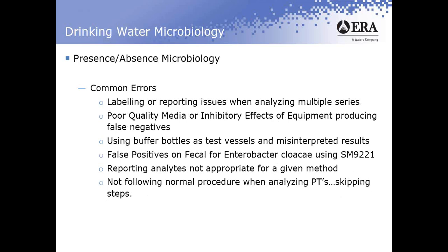All right, what are some common errors that we see on this particular sample design? Let me qualify. When I say common error, the errors are in fact not very common at all. It's going to vary by the reported analyte, total fecal or E. coli, and it's going to vary by the organism that's being used, whether it's the E. coli or the Enterobacter or the Pseudomonas or any other microorganism that may be used.